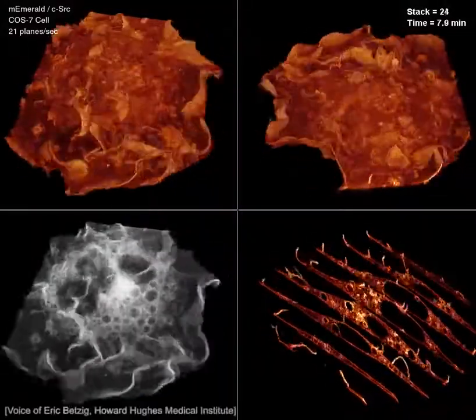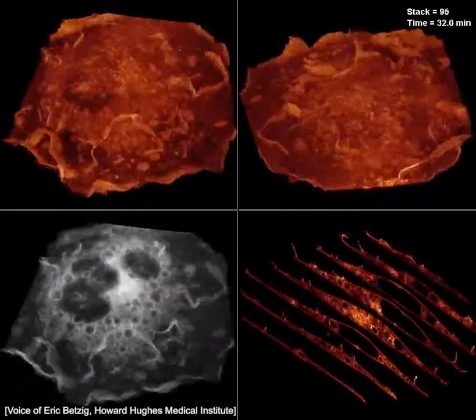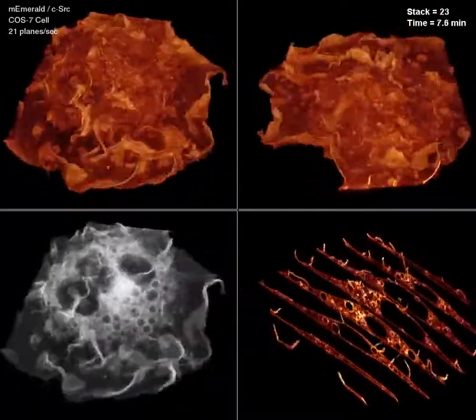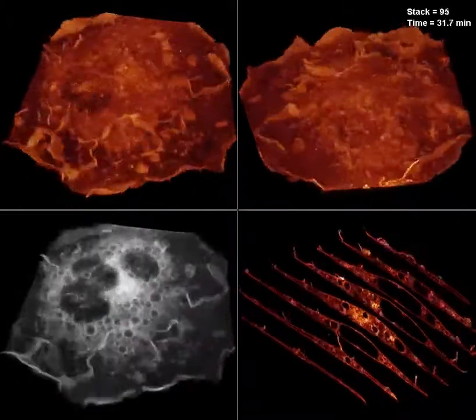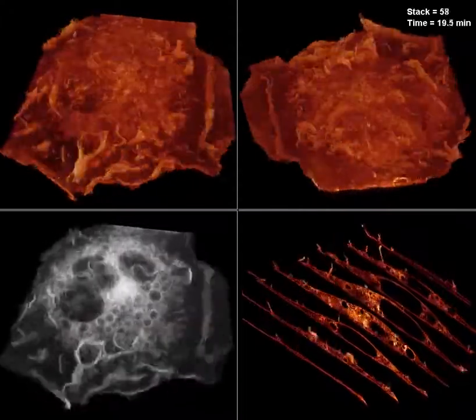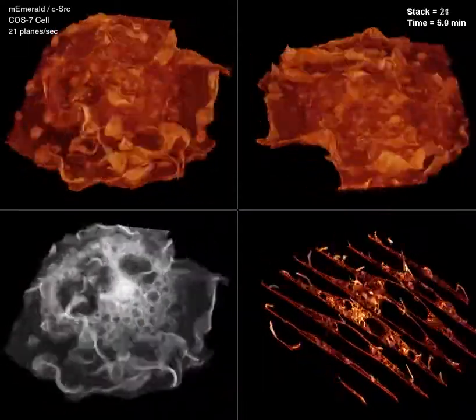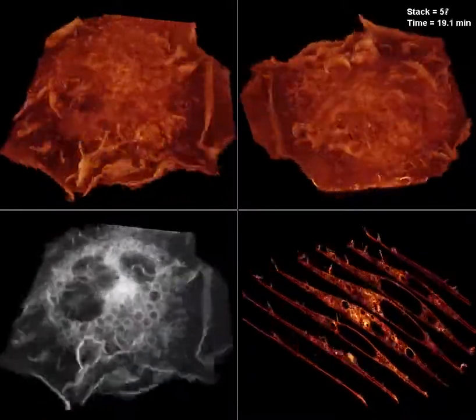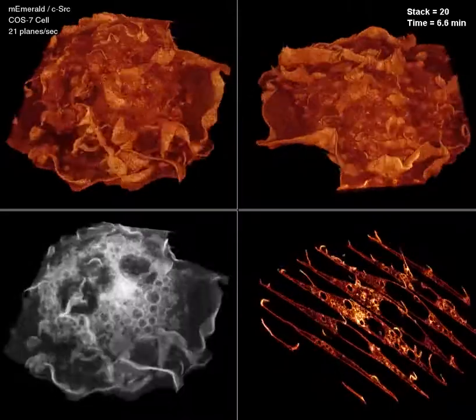The membrane ruffling example is a cell that has been transfected with CSARC, a cancer signaling protein, which promotes the membrane ruffles you see in the movie. The ruffles fold over on themselves and create a little bag that encapsulates extracellular fluid, forming vacuoles underneath.